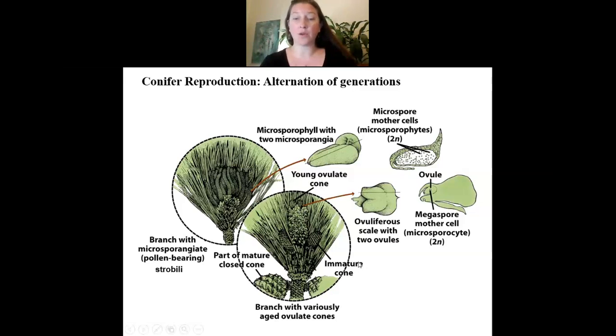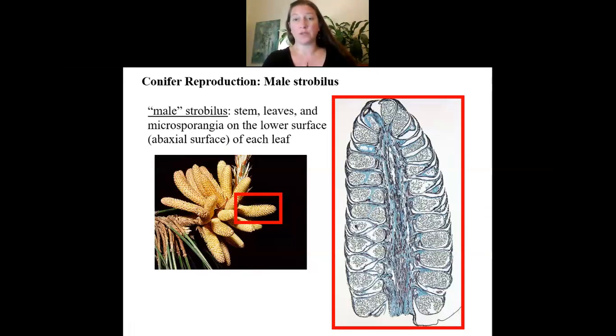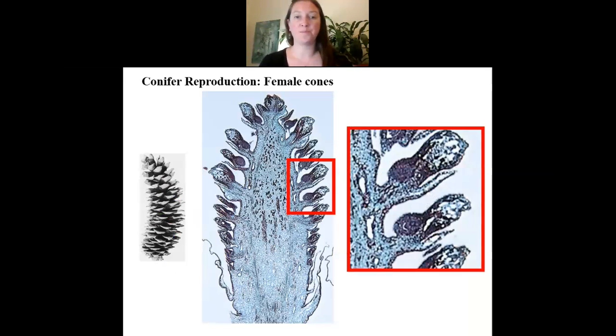So basically on the cone, here we go. This is a strobilus. So here's a cross section through a strobilus, and you can see the microsporangia. Here's one, full of microspore mother cells, and then ultimately full of pollen grains once the microspores undergo those processes. So there's a strobilus of a conifer, and then the cone. This is the only thing we kind of have to talk about in terms of how alternation of generations is different, because now we have this cone to deal with.